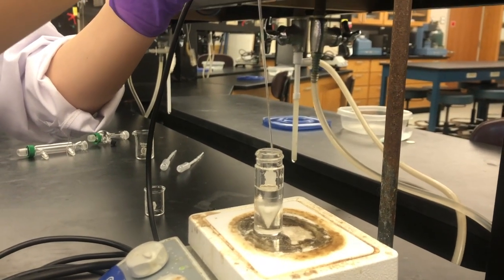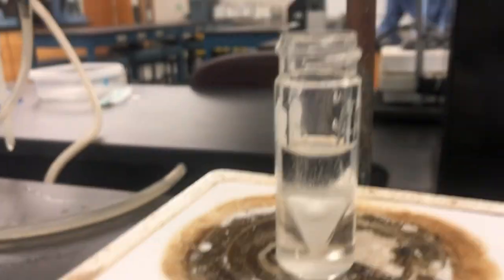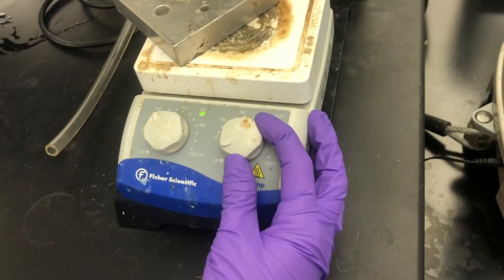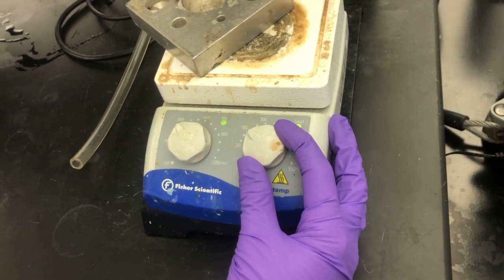Place a conical vial onto a hotplate and activate the stir feature. Add a stir bar. Place an aluminum block on the surface of the hotplate and set the temperature to 120 degrees Celsius.